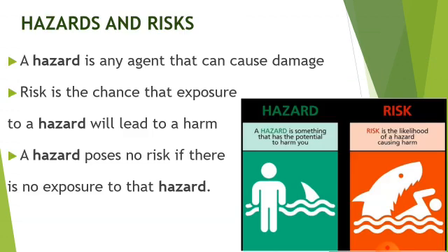Hazards and risks. A hazard is any agent that can cause damage. It can be any chemical, any needle even. What is risk? Risk is the chance that exposure to a hazard will lead to harm. Risk is associated with exposure. A hazard poses no risk if there is no exposure to that hazard.